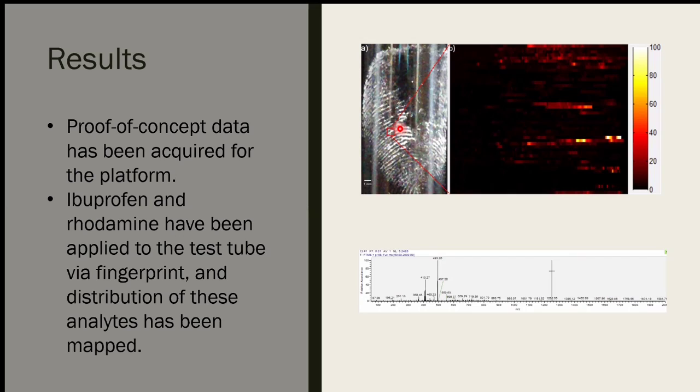will move it in the Y, Z, and X direction to the beginning of the next line. And so you don't usually go over part of it again, because of how the solvent interacts with the glass and such. It can sometimes pick up things from nearby lines, which can cause problems.